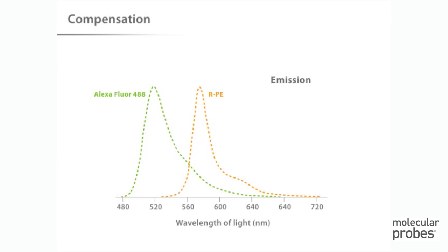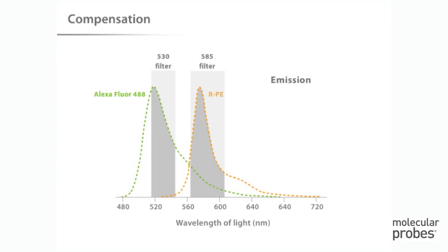Here we see Alexa Fluor 488 fluorescence collected with a 530 nanometer bandpass filter, and RPE fluorescence collected with a 585 nanometer bandpass filter. While each of these filters efficiently captures the emission peak of the target fluorophore, each one also collects a little bit of the other fluorophore due to spectral overlap in the emission profiles shown in red. For this pair of fluorophores, the amount of spectral overlap of Alexa Fluor 488 dye into the RPE channel is greater and requires more compensation than the amount of spectral overlap of RPE into the Alexa Fluor 488 channel.